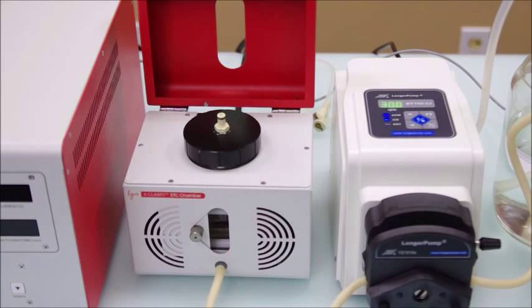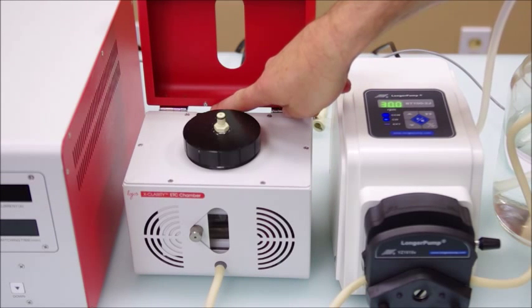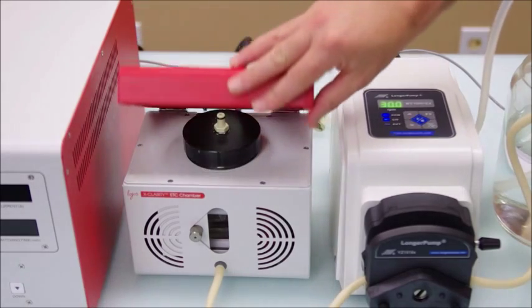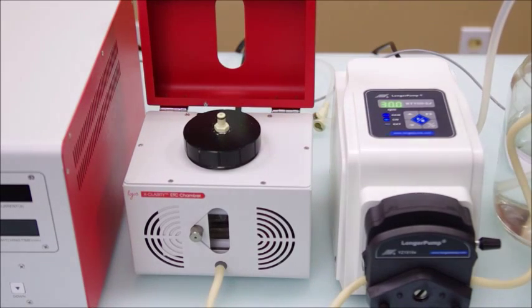A few notes before we begin. First, always fill and drain the chamber primarily using the pump. The chamber has a switch that detects if the chamber lid is open or closed. If this lid is open, or the switch becomes encrusted with chemicals, the controller will shut off and the clearing will not take place. To prevent any spills, this is why the chamber is filled and drained with the pump.